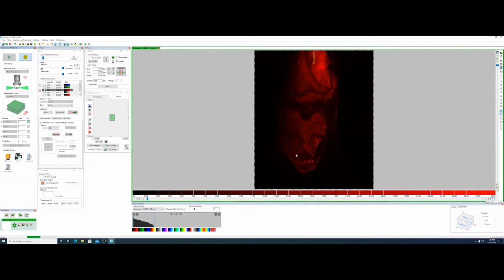We're going to readjust the brightness and contrast again, so now you can see that in the Y dimension the whole sample lights up. The horizontal focus is set to this position, which is not the best because our incident light sheet is the right one, so we should put it farthest away from the incident light. Putting it in the middle kind of wastes it, because one should put it furthest away from the incident light sheet. If we illuminate it with the left, it's equally dim. So I think in our scenario the best is to use both light sheets.